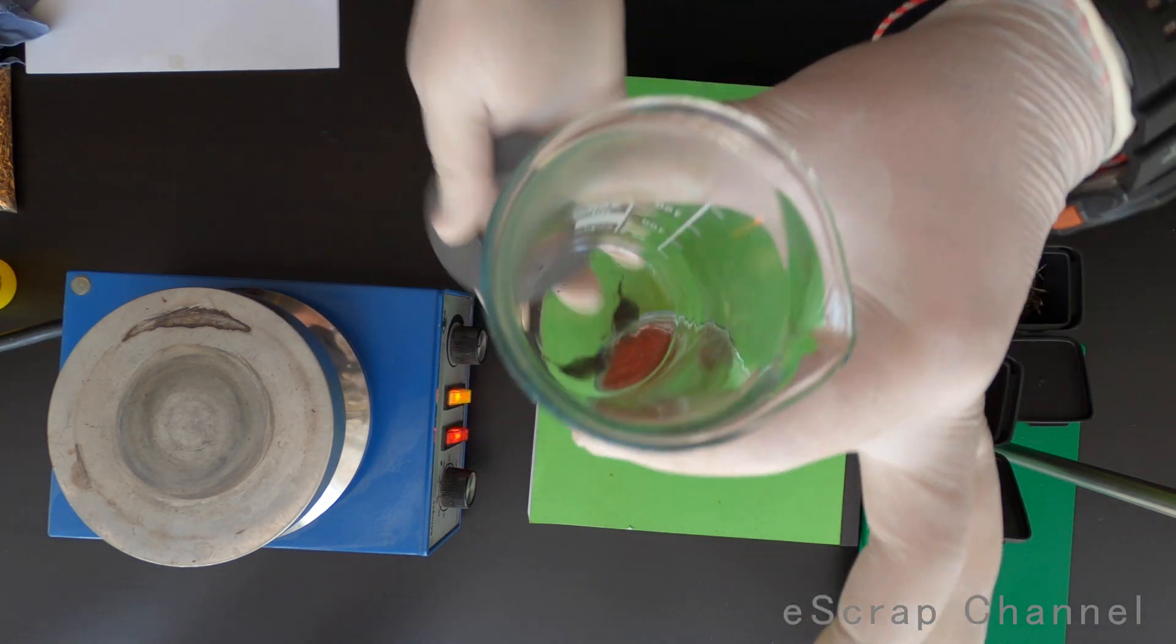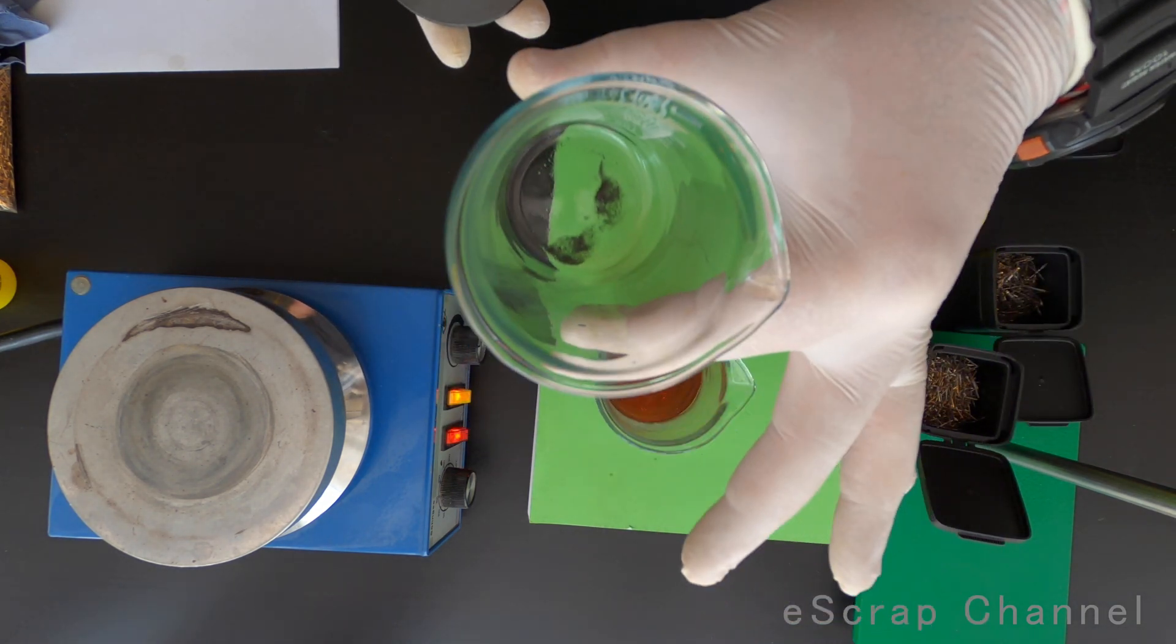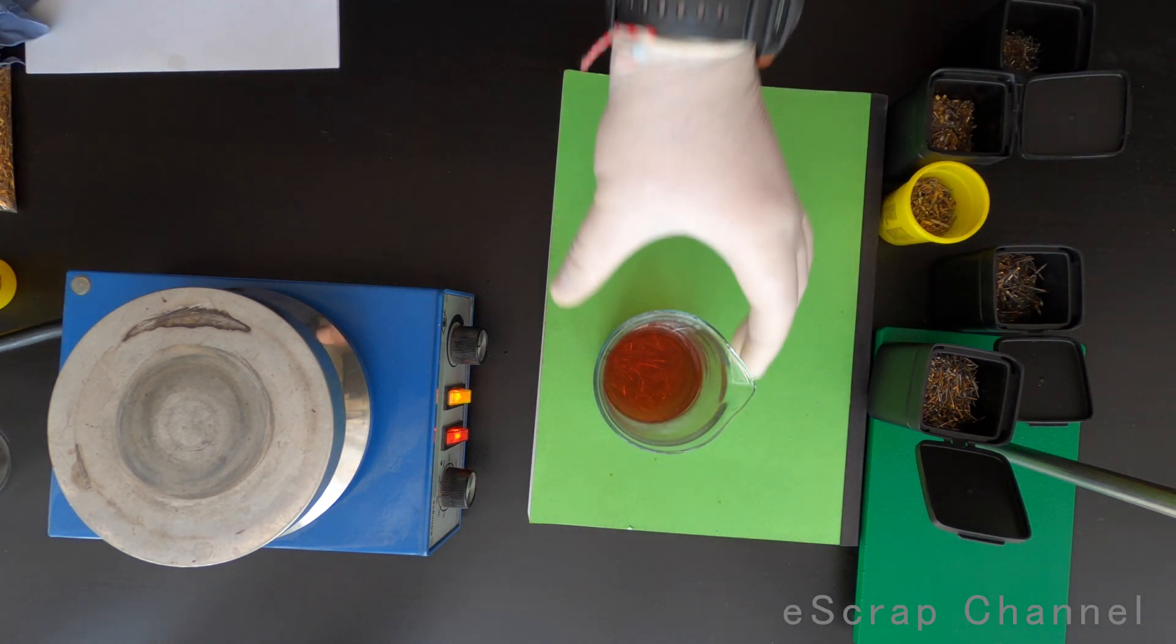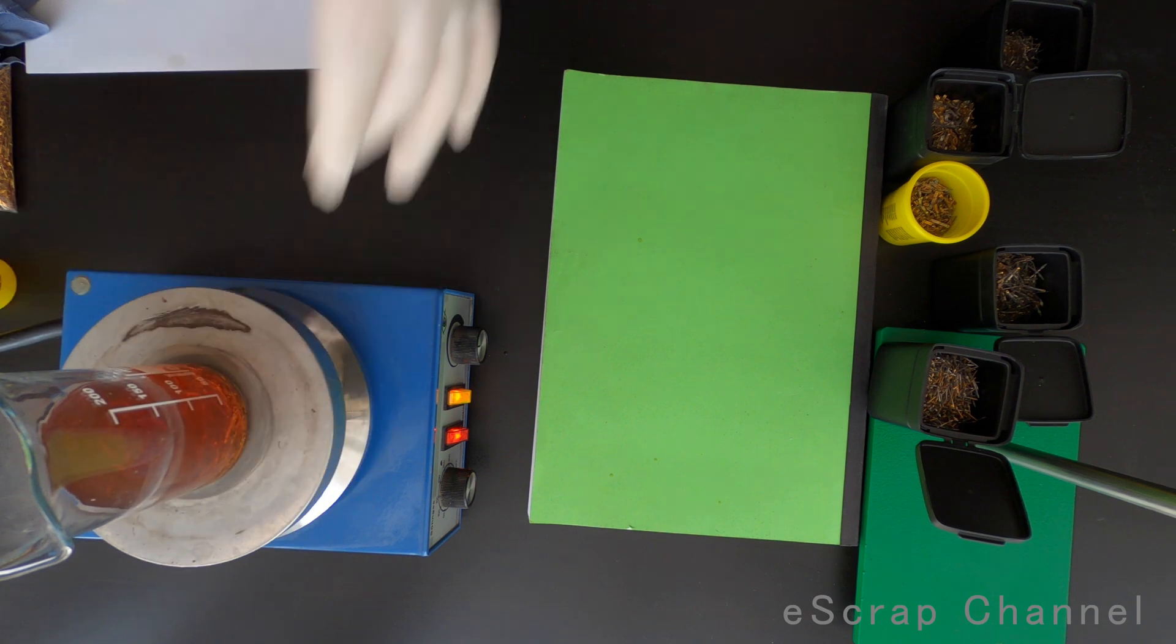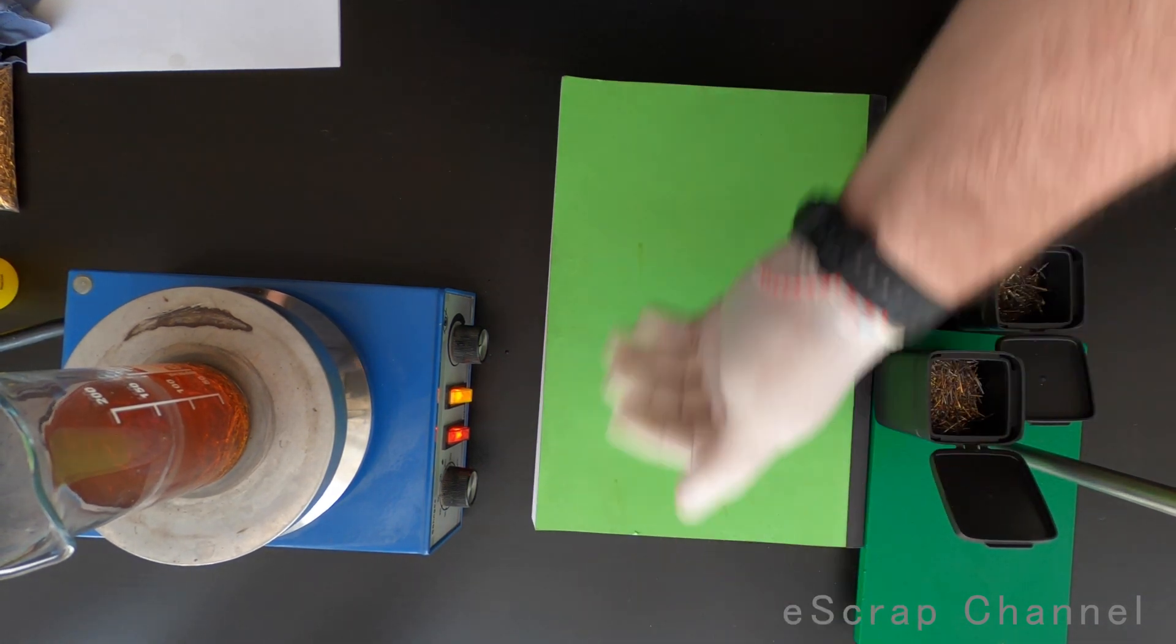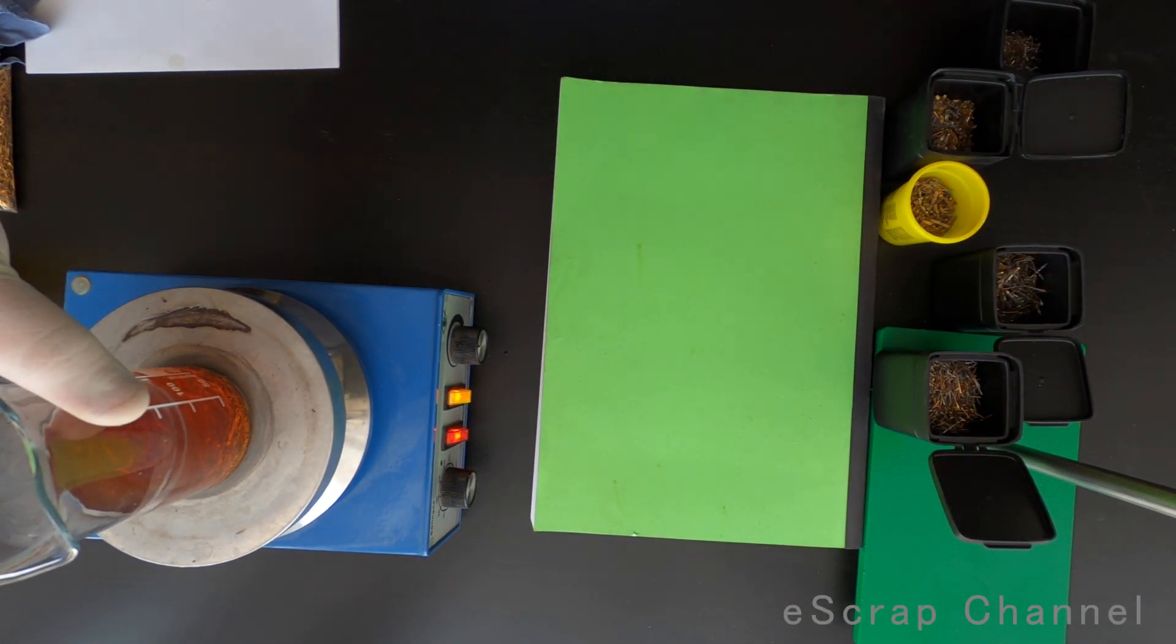Here it is. You can see on the bottom there is still some magnetic material left. Now put it back and continue heating this. Let's see how long it will take to strip the gold.